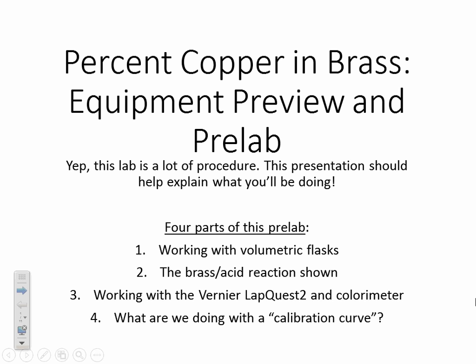And I recognize that. I know that you're probably a little overwhelmed. Wow, I don't know what to do. So, watch this video. I'm going to be showing you a lot of pictures and diagrams that I took myself, so they're not just off the internet, to show you what the equipment is that you're going to be working with and how you're going to use it and what goes where, and hopefully you'll feel a lot more comfortable with the lab after watching this.